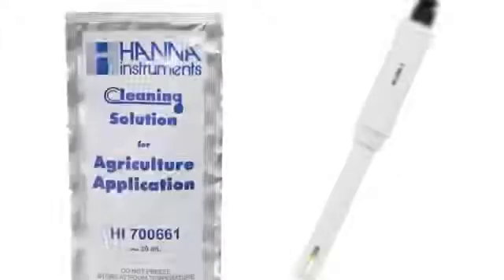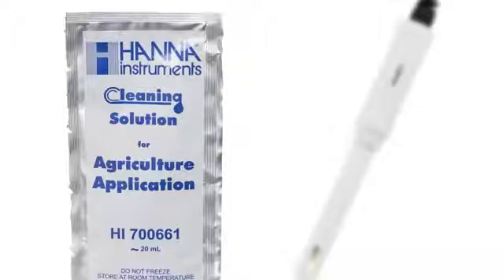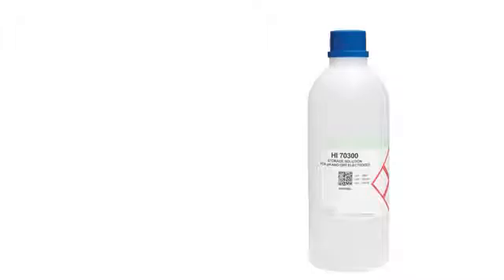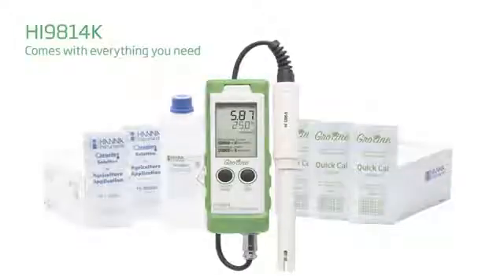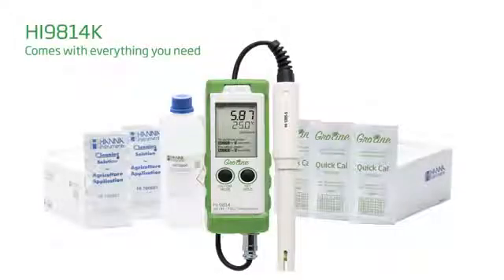It is important to periodically clean your probe and set a regular schedule for probe maintenance. To clean the probe, place the probe in the agricultural cleaning solution for 15 minutes. Rinse the probe with distilled or deionized water. Next, place in storage solution for at least two to three hours. Calibration is necessary before taking any measurements.